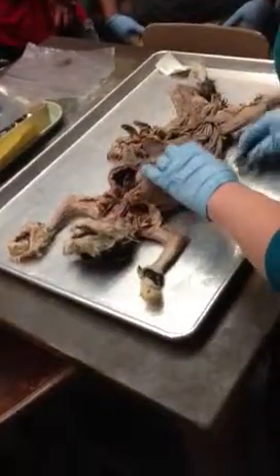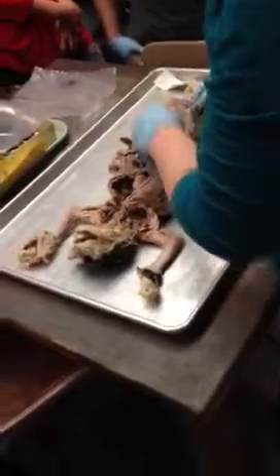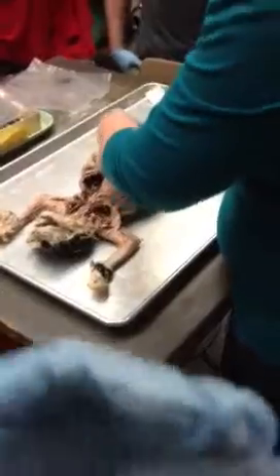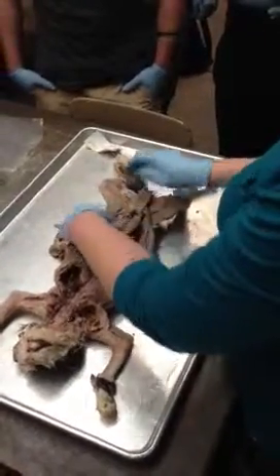You want to find your ureters. There's one that comes off of each kidney and goes to our bladder. It may be easier for you to start at the bladder and work back up. Okay? They're not injected. Okay? So you're not going to see much color change in them. Okay? So here's one ureter here, and then on this side, this one has not been cleared away yet. Okay? So follow that to the bladder.